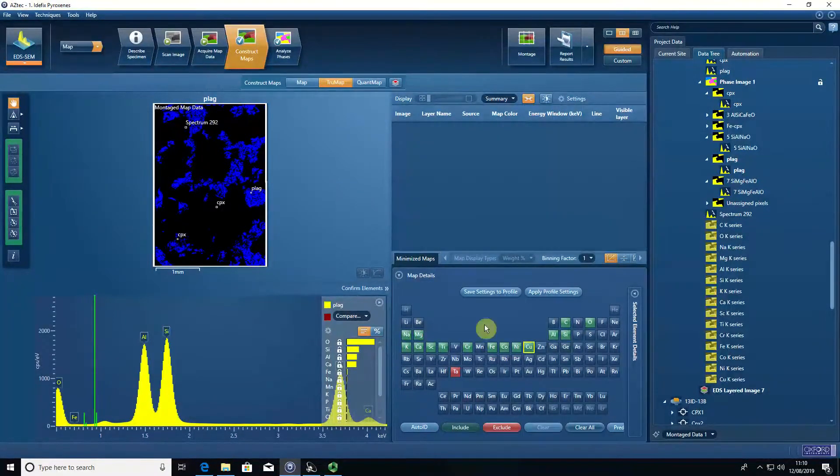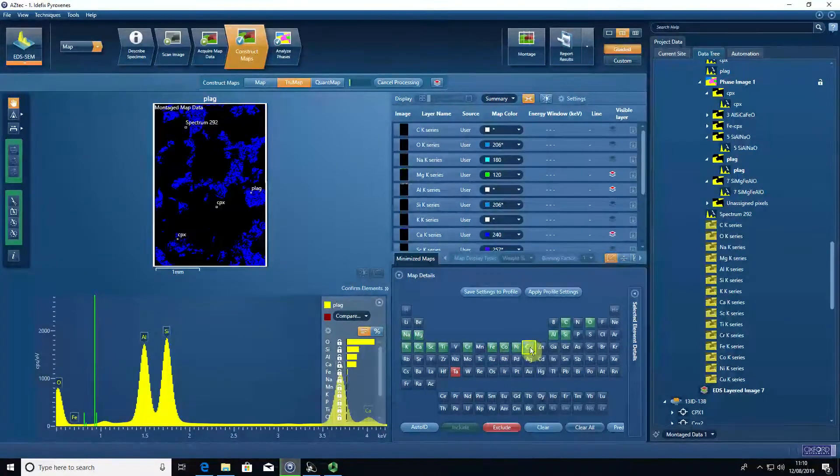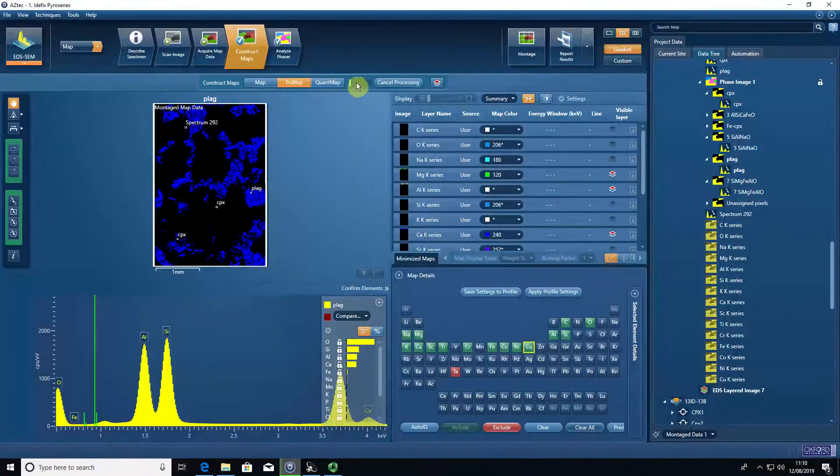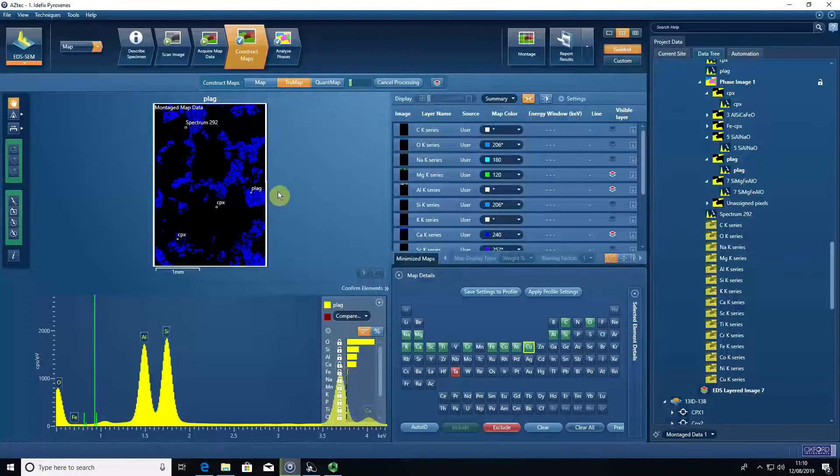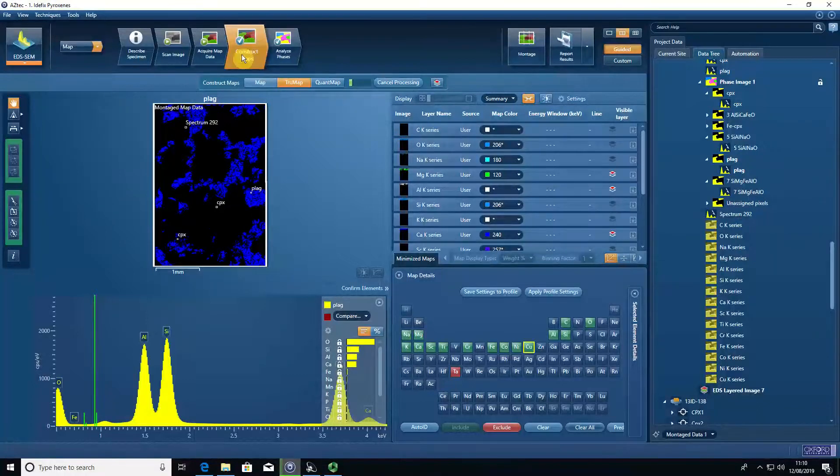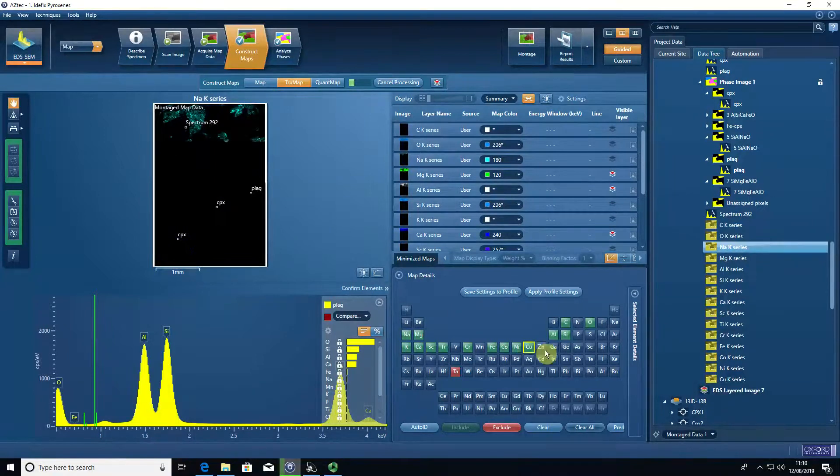It's important to get that list before you true map because you can see each time you change an element in here, the software starts true mapping again. If you've gone through and set all your colors and all of your brightness and contrast, it's going to reset all that each time you add a different element.